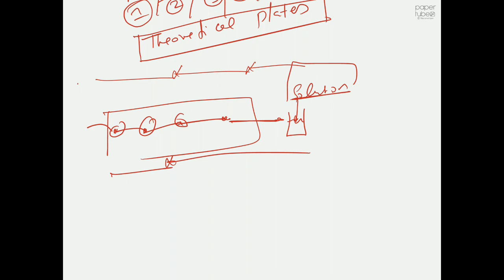And then we already talked a bit about silica particles, like their shape, their size, their porosity, pore distribution, surface area, and so on. So this Van Deemter equation will also contain one term which is directly connected to the properties of your packing material. It has nothing to do with what compound we are going to separate or what solvent we are going to use, and so on. So keep those things in mind.